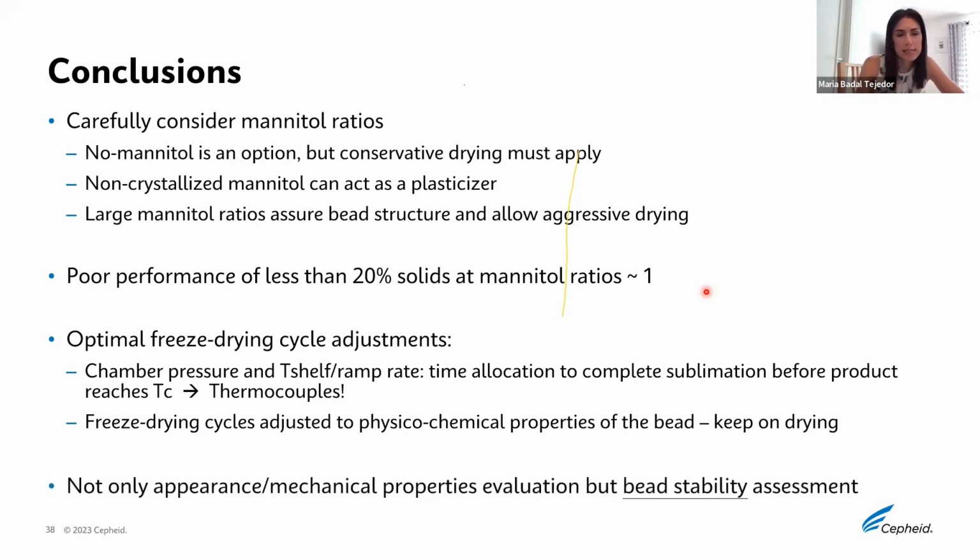And then, of course, in this case, we evaluated the appearance and the mechanical properties of the bead, but it's important also to evaluate what our bead stability is going to be when we have an active component in the bead.